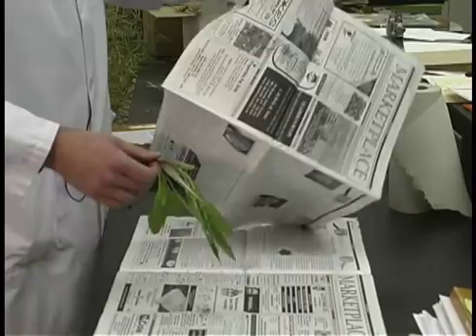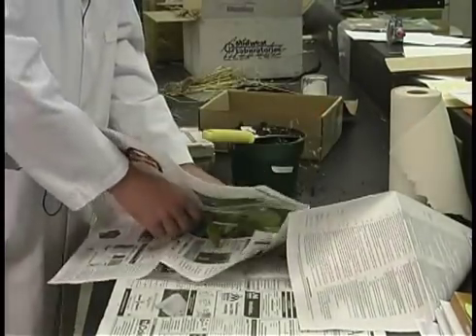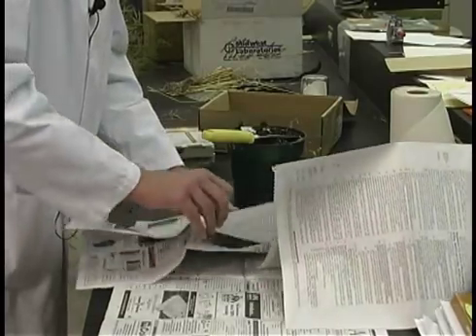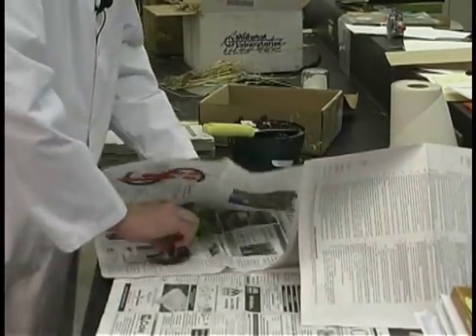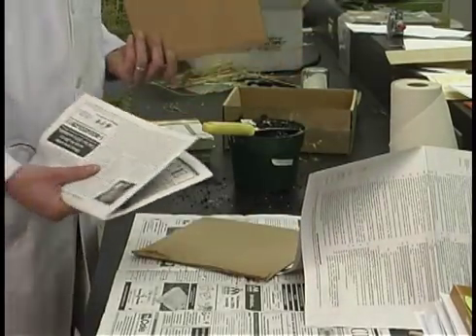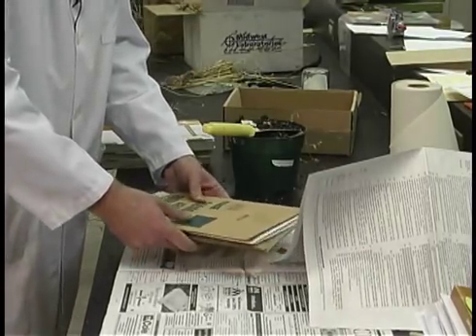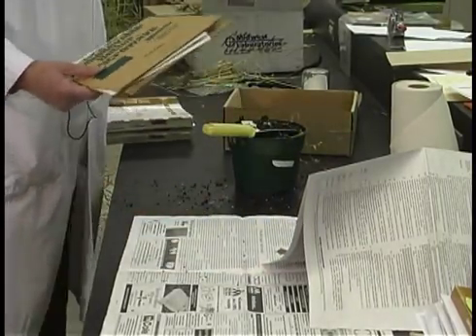From there, take the newspaper. If it's very wet you may want to leave it for a longer period of time. If it's not, just take the plant, put it in a newspaper, and to prepare for shipping, it's not a bad idea to take two pieces of cardboard, put the plant and the newspaper behind there, and then place it in a rigid container.